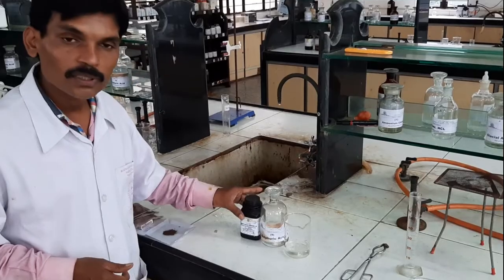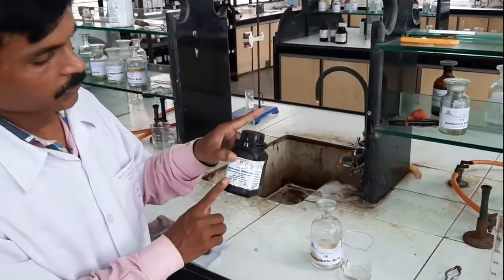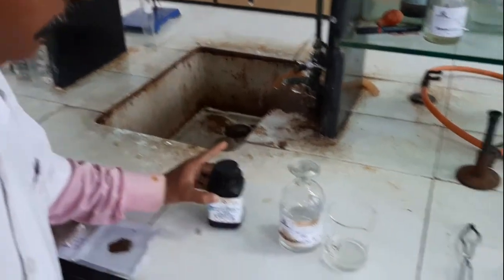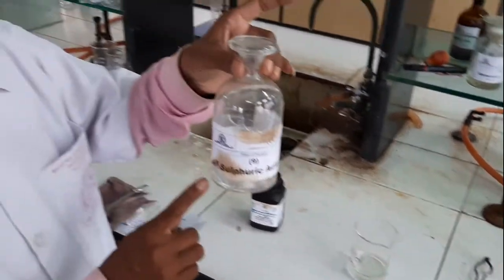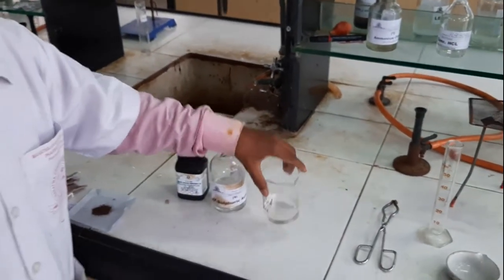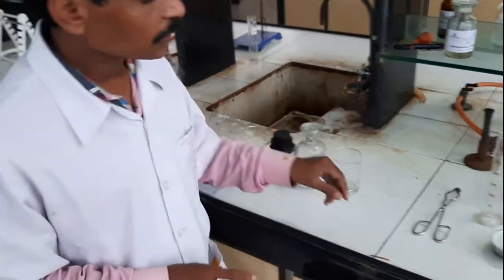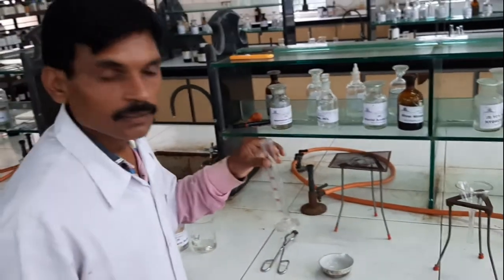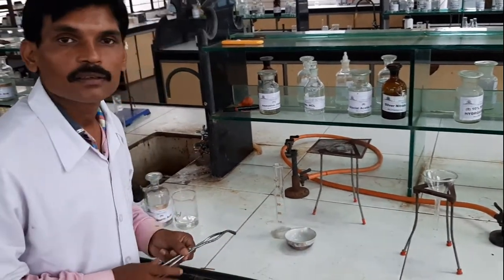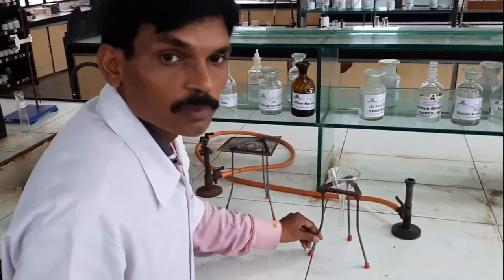As per our requirement, we require iron metal powder, dilute sulfuric acid, and distilled water. This is our chemical requirement. Similarly, we require a measuring cylinder, a porcelain dish, a pair of tongs, and a filtration assembly.